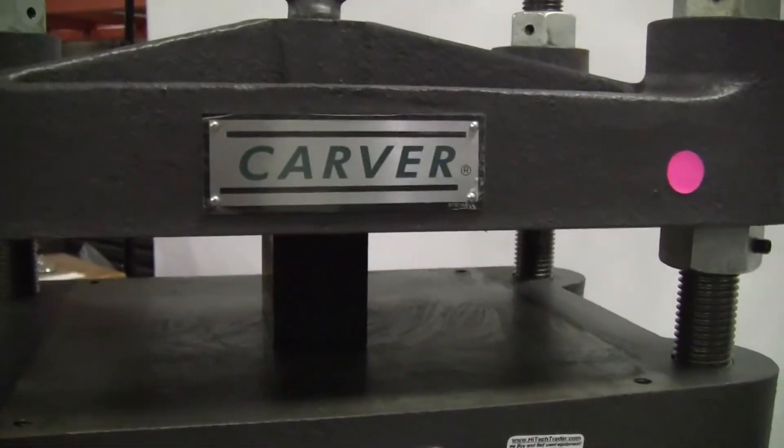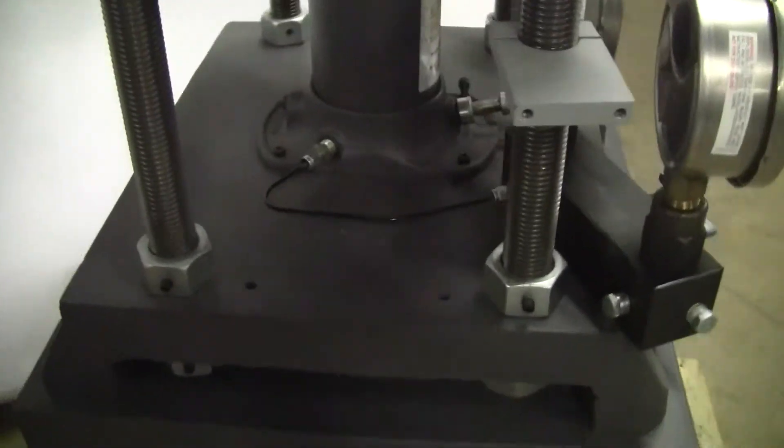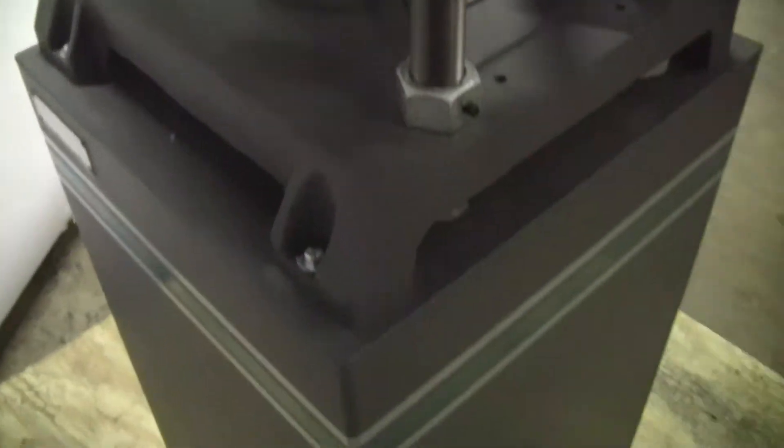You can see we have an aluminum block under pressure currently. Here is the rear of the unit.